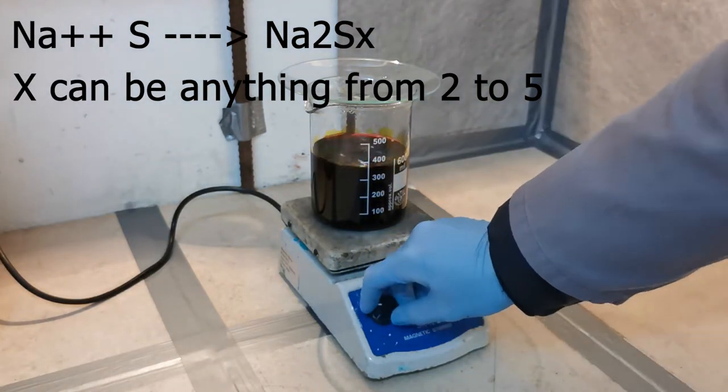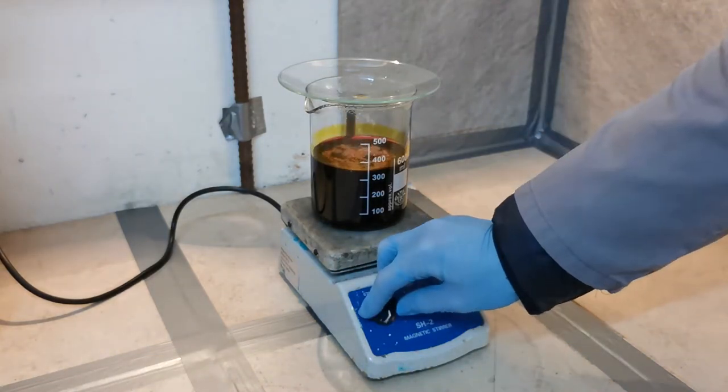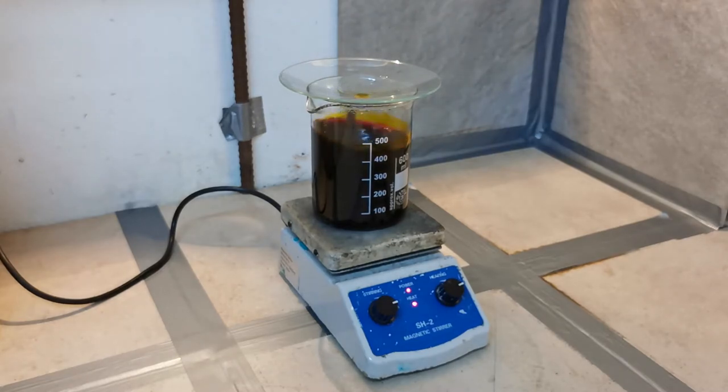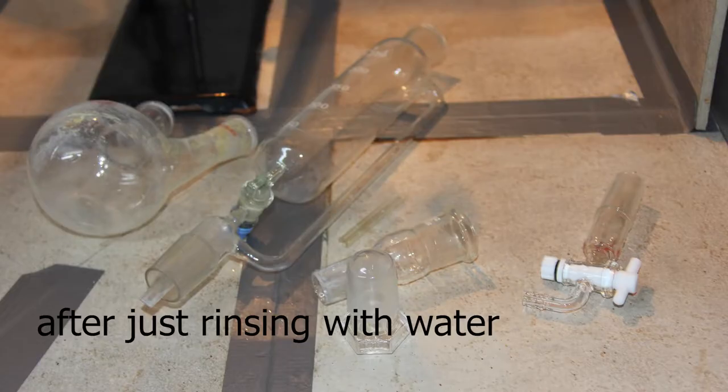If the ratio is lower, you will use more sodium hydroxide than theoretically needed, but you will have less chance of building longer polysulfide chains, which may precipitate later and be difficult to clean. In the video, I used a ratio of about 1.7. Some polysulfide chains were formed at the end, but it was still quite easy to clean.